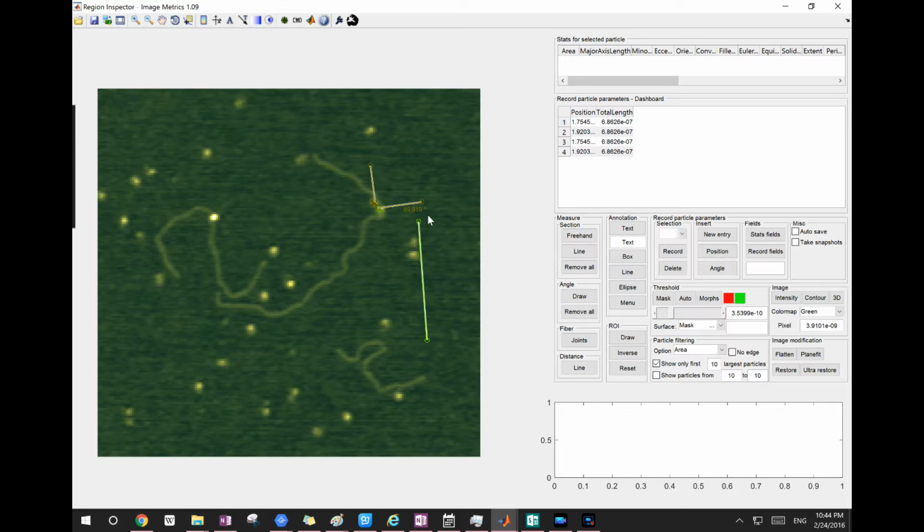So it's basically the same thing as when you adjust the appearance of the particle selections. They have these number labels. I attribute them all as labels, so you can adjust their appearance. So right now it's like 89 degrees.